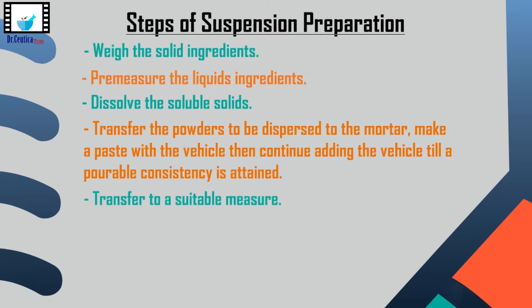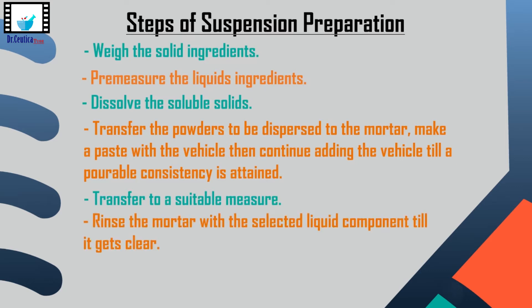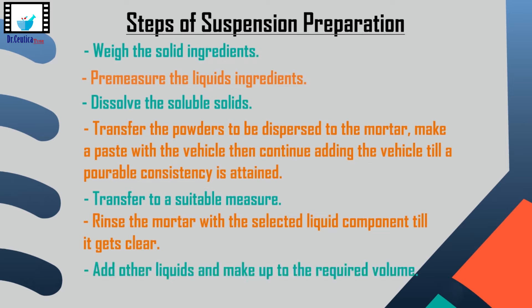The resultant suspension is transferred to a suitable measure — let's say a conical. The mortar is rinsed with the vehicle and the rinsings are added to the conical so that all the material is transferred. When we are sure the mortar is clear, we add the liquid ingredients to the conical, then make up to the required volume using the vehicle. Finally, we stir and transfer the prepared suspension to the container.